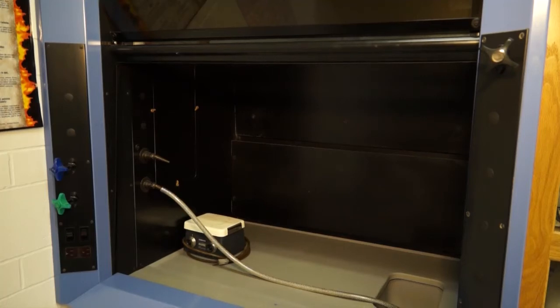Okay, the next piece of equipment that you need to make sure that you have available is the chemical safety hood, so that when students are actually working with chemicals that might produce fumes, that they are working inside this hood. And it cannot be used as storage, and it must be kept clean, and it can also be inspected on a regular basis to ensure that it's working properly.